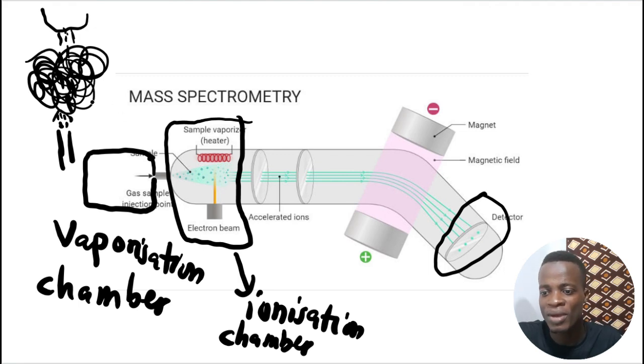At the end of the day, some of the atoms in the gaseous sample become ionized, become an ion. Because you say an ion is formed when a species loses an electron. So when a particular species is releasing an electron, it is going to be a cation. It's going to form a positive ion because we are losing electrons.